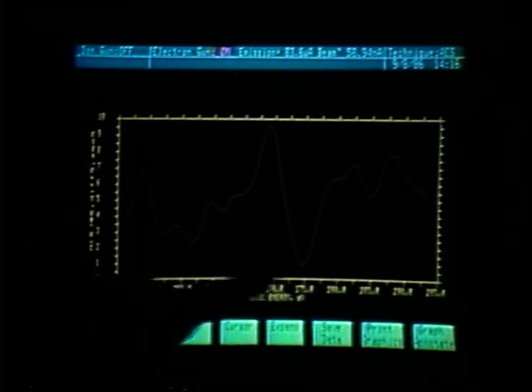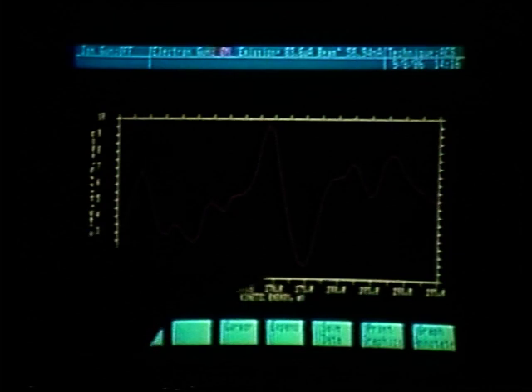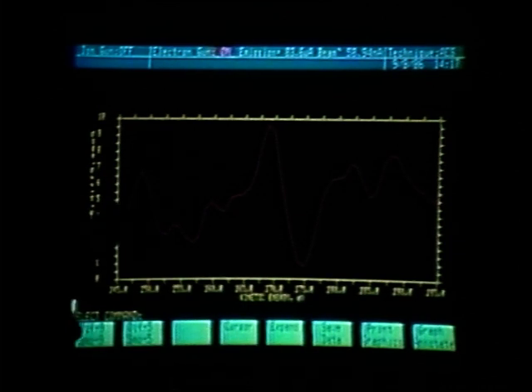We now see the carbon peak at 4 minutes into the profile. We see that indeed we have a real peak present, so it is not erroneous data, it is indeed a carbon peak.